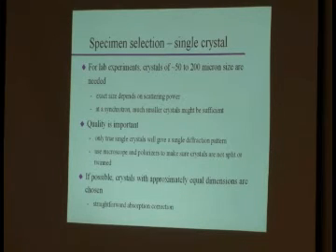Now, I've never pushed it quite that far, but when I was a postdoc, I made a sample that was a pretty nice fine powder. And I actually ran my powder data. I could get some indexing, but I could not go anywhere with it. And I tried to grow crystals, and the stuff was always between 5 and 10 microns. No chance.